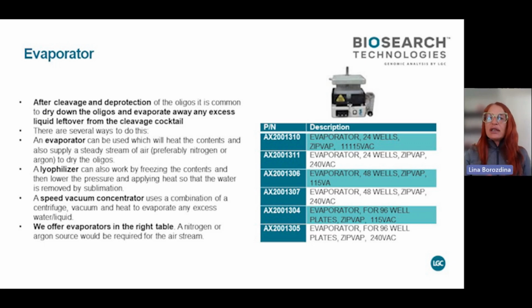There's a second choice. It's a speed vac. It's a centrifuge with the vacuum. You can purchase those. They're quite common as well. So in that situation, it spins, keeps the solution close to the bottom, and it lyophilizes the oligo, so it pulls the solvent out. So there are different ways of doing that. If you have questions on the specific ones for specific application or the instrument, I do provide different options for your specific needs.